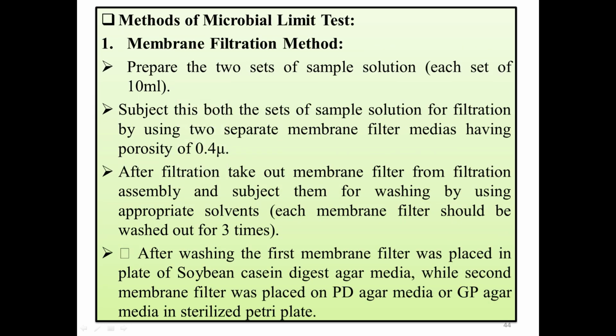In this method we have used 10 ml of sample each, and this sample solution is passed through the filter, and these filter papers are cultivated with the help of specific agar media. After incubation we'll have numbers of colonies of microorganisms present in the sample, if there is presence of microorganisms in the sample.